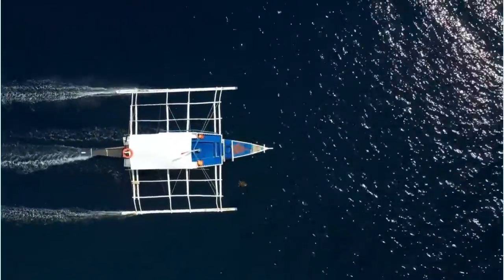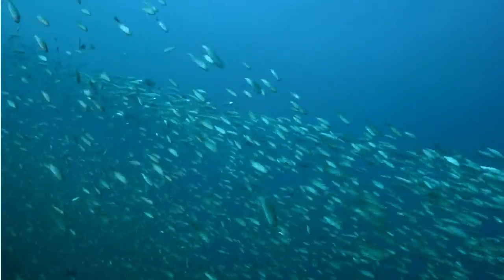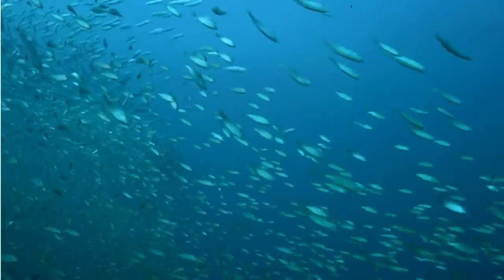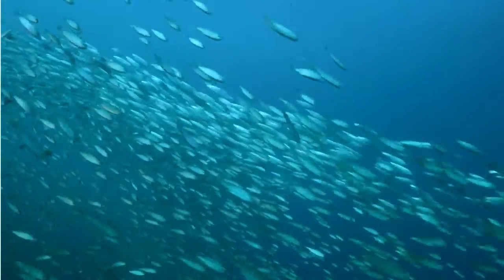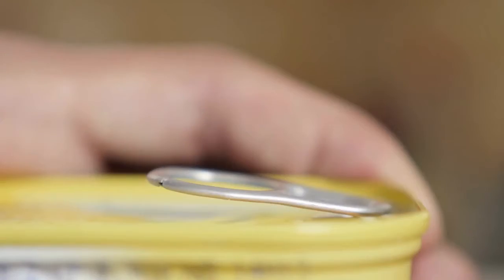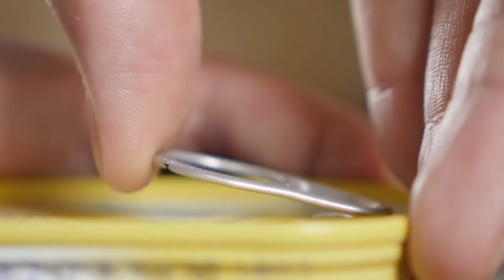Sardine are any of certain food fishes of the herring family Clupeidae, especially the members of the genera sardina, sardinops, and sardinella. Today, we will be exploring the anatomical features of a fish from the sardinella species, otherwise known as tamban.